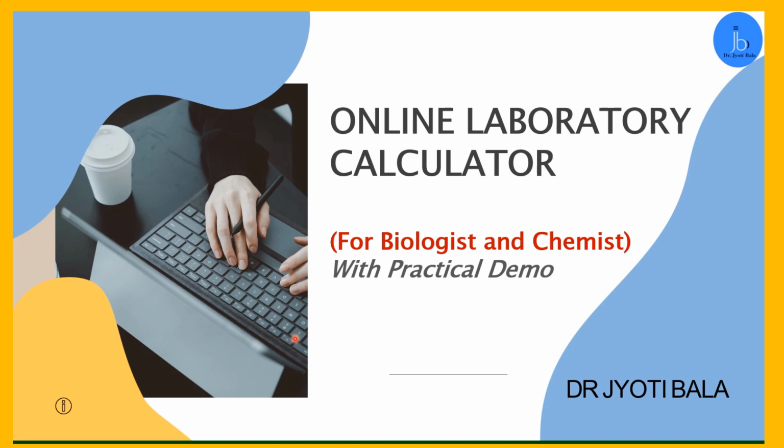So this session will be useful for both biologists and chemists who are dealing with DNA, RNA and protein on a daily basis. You have to perform a lot of different experimentation and conversions. For that purpose, you can utilize this online calculator. I will be showing you one practical demo also here.